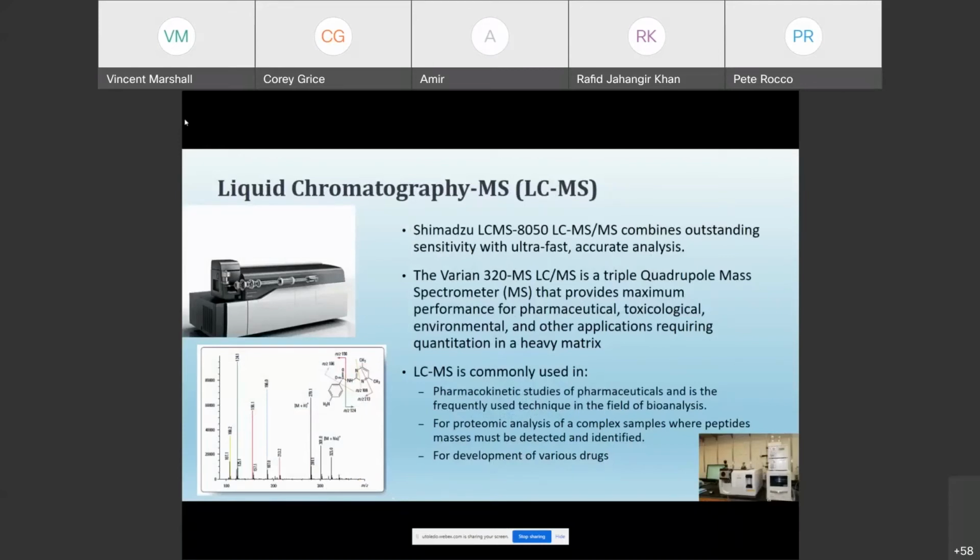how it analyzes. But the difference is the ICP is only for elements, because it essentially has a high energy method of breaking down the sample upon submission into the instrument, so that it fully ionizes. So everything is blown apart. But this one is much lower energy. It really doesn't damage any of the materials as they're being separated. And then only when it goes to the analyzer is it destructive, but in a way to actually understand the size and relative contributions to the organic part of the sample.